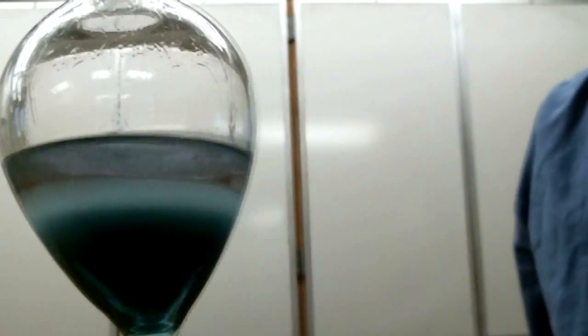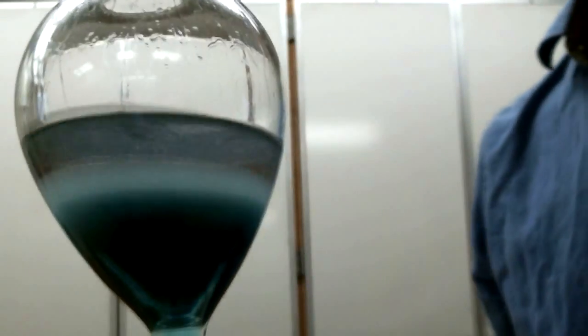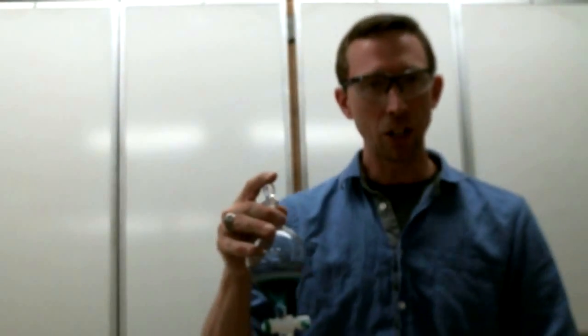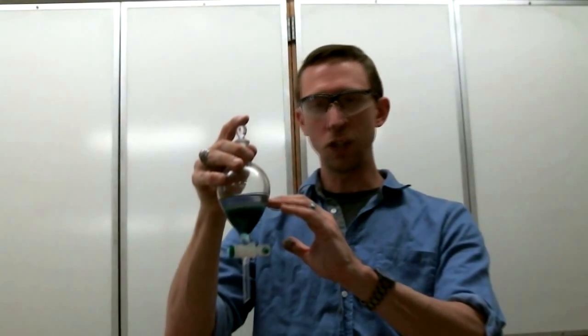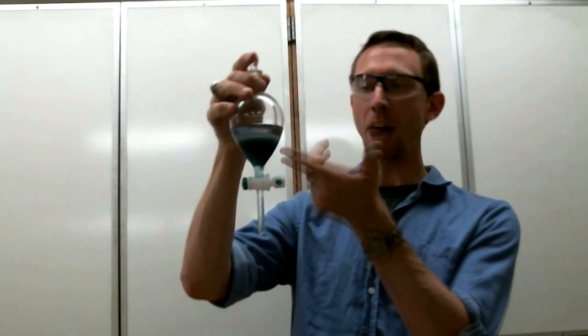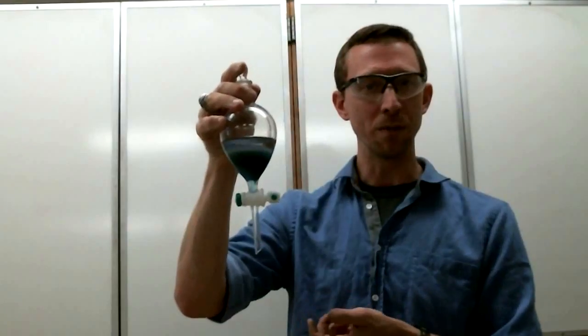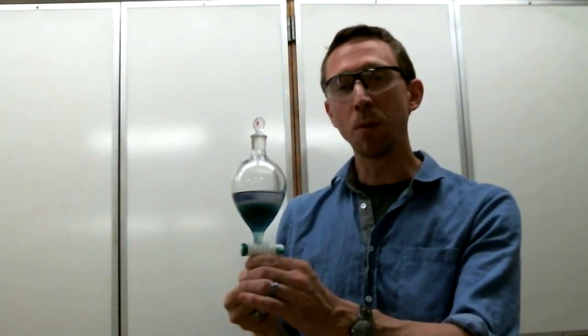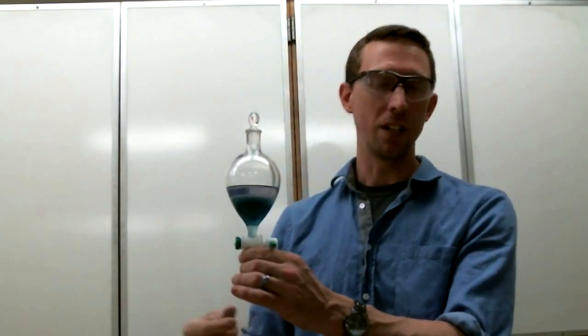You can see that N-butanol layer is very, very light in color, and the aqueous layer is much, much darker. So I have successfully extracted the dye molecules from the N-butanol solution into an aqueous solution, which I can simply collect by opening the stopcock and draining only the aqueous portion of my mixture. So this is the principle on which liquid-liquid extraction takes place. Compounds partition themselves between two immiscible solvents based upon their relative solubilities.